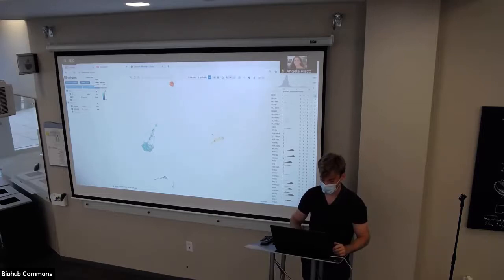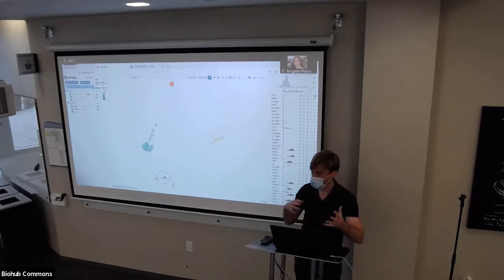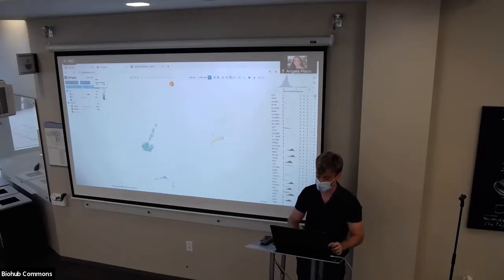You can click there. You can click here. It's low expression. So this is really helpful for people who have trouble seeing colors, or in cases where the gene expressions are extremely scattered. Because a lot of times you have really bursty, speckly patterns of gene expression that make it hard to see concentrations on the scatter plot itself.